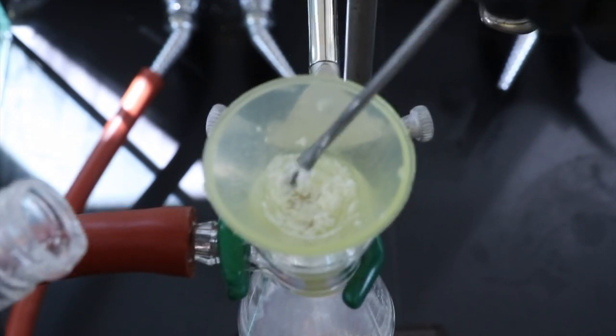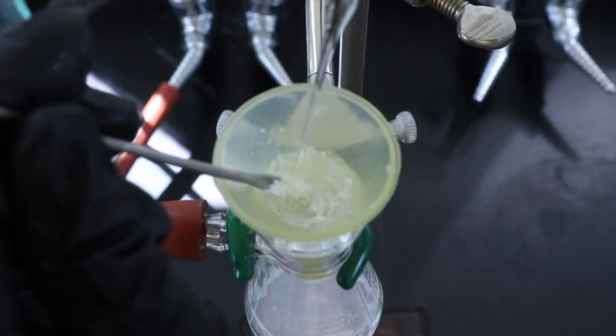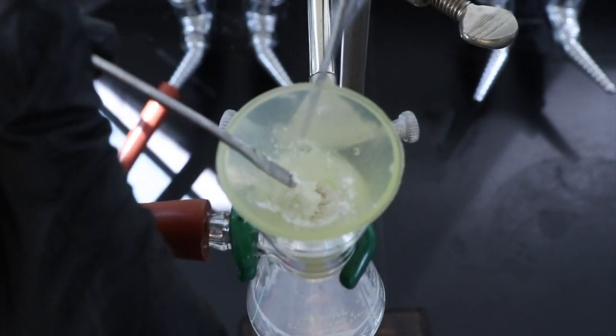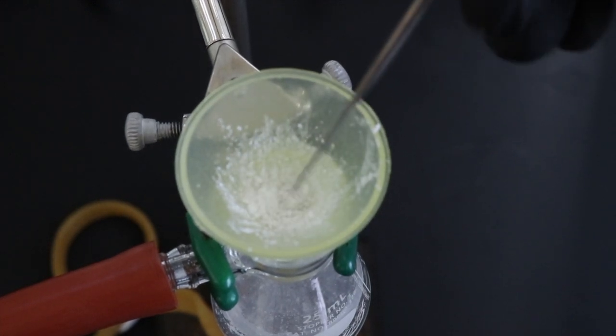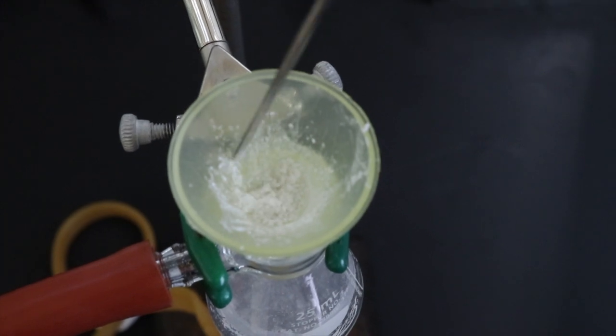As you can see, it's pretty sticky and clumpy right now, but eventually that'll dry out. I'll keep rinsing it with water just to make sure that I dissolve and remove anything that I don't want there. And after a few minutes, you can see that the crude product is a lot more dry now and is probably ready to be removed.